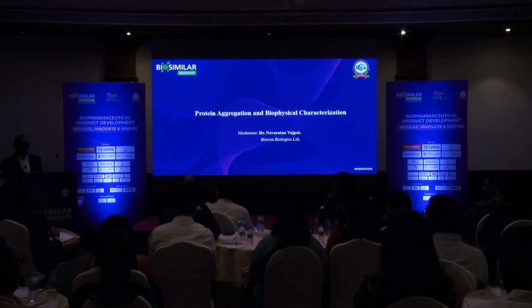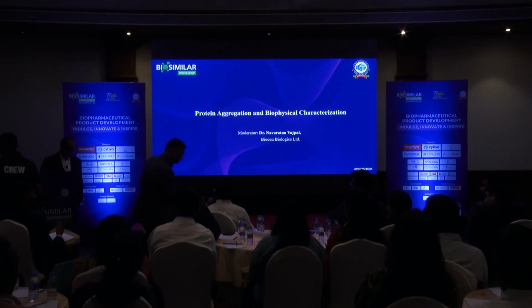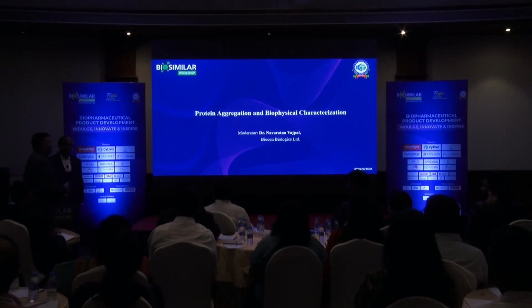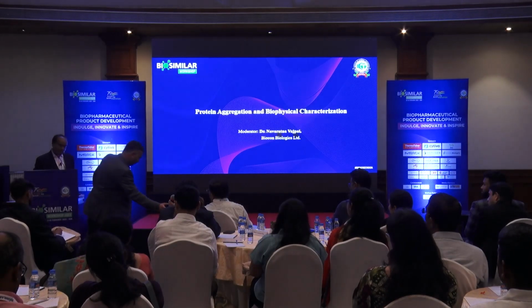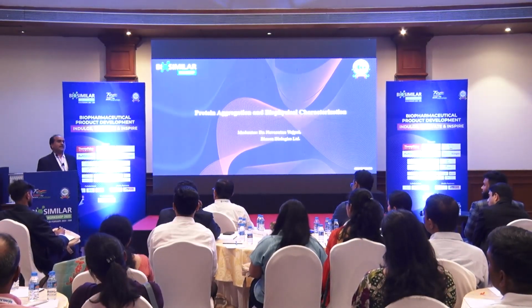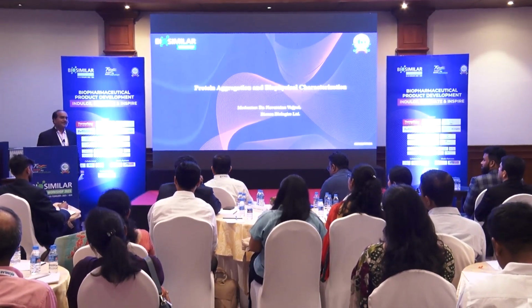Ajinda has a question. The small changes that you have monitored using the NMR as well as AUC, how are they reflected in terms of the potency or the bioassay of the molecule? So, you know, aggregation causes the immunogenic response. Now, what we characterize is a structural change.